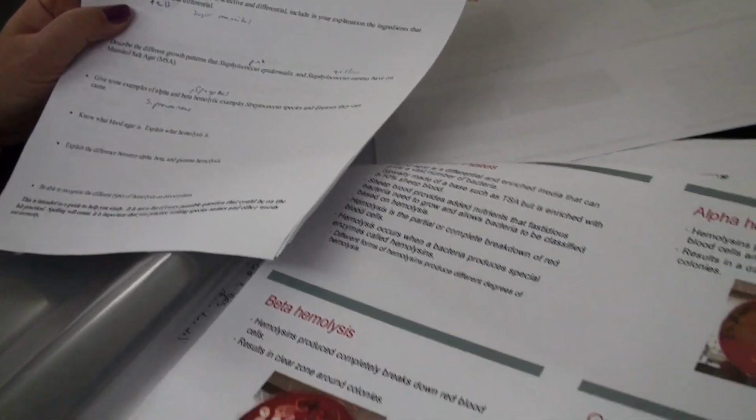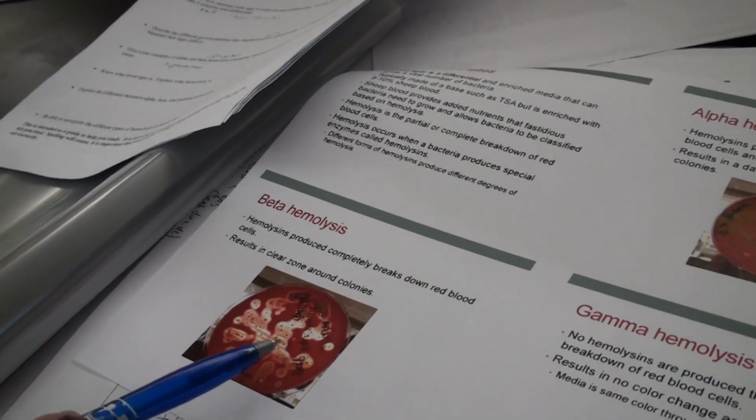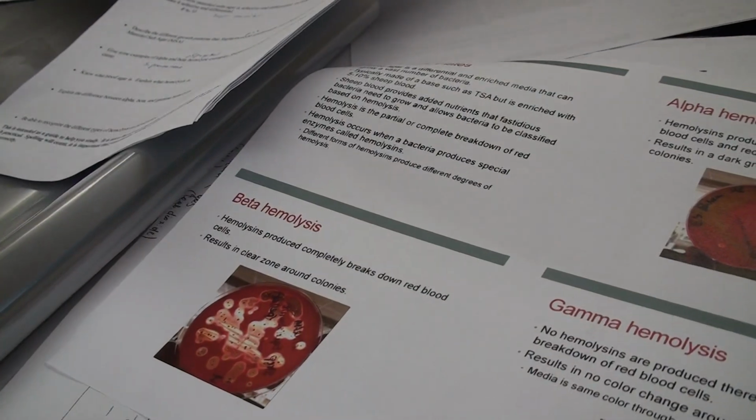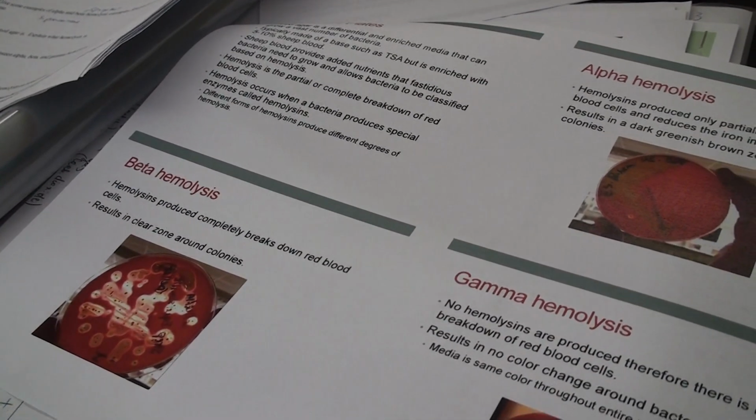We have very good examples that we got. So you'll see one of these. It's going to be fine. He'll tape the edges, and you can hold it up to the light, and I think you're going to see the results better than if you just set it on the table. But he'll have a little card there that says you may pick up this plate to observe. Okay?